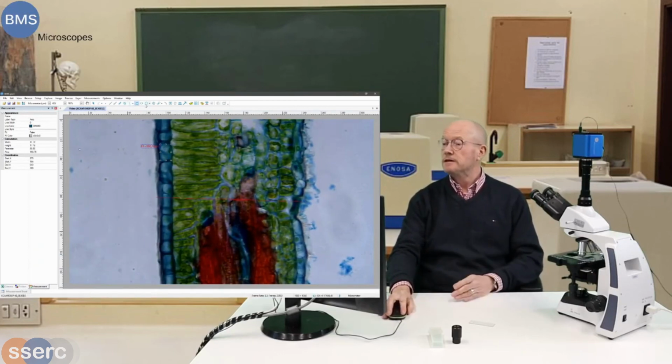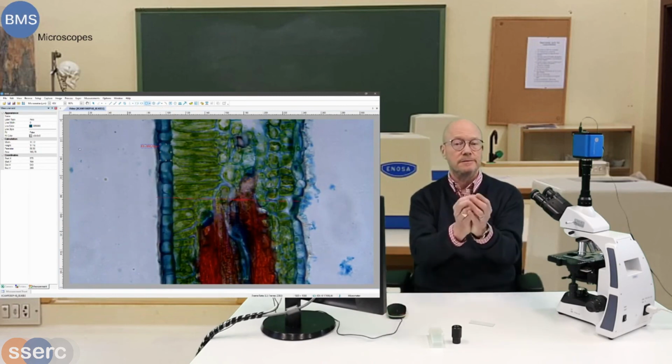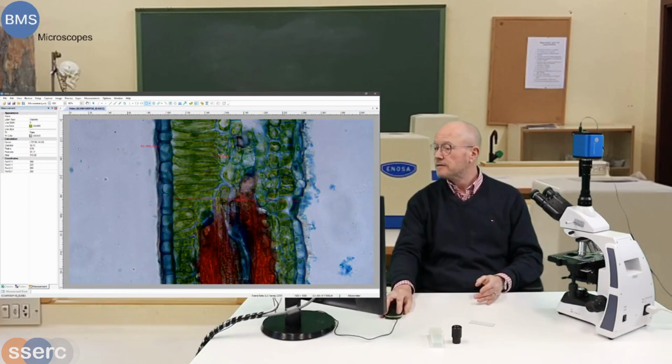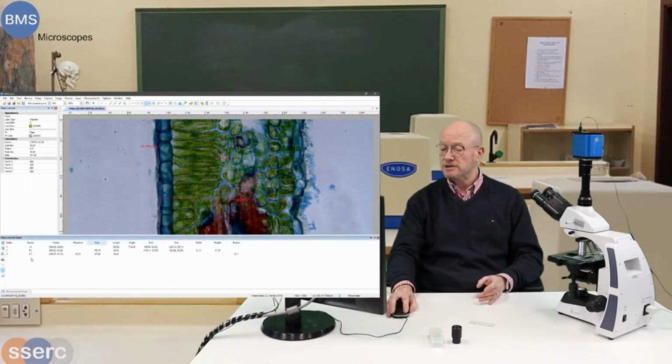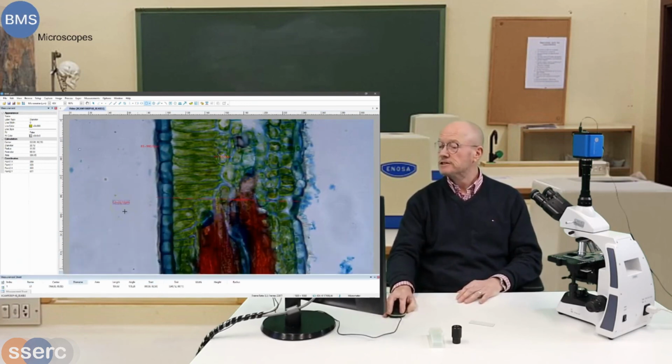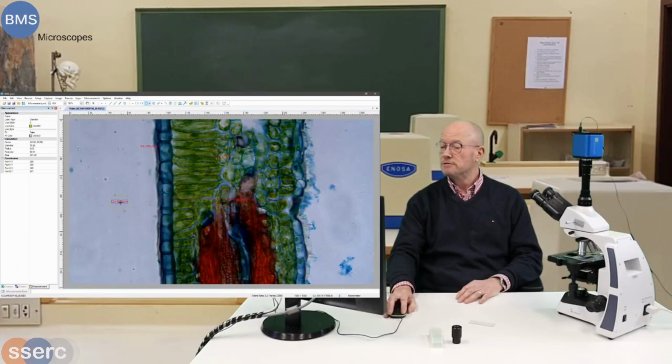I can do a circle measurement also if I want. Here is the circle measurement of 2 points. If you have, for instance, a core of a cell, you can measure that. For instance, we want to have this shape here. In circles, you can see here, when you see the measurement C1, it gives you the diameter, it gives you the area, and that is of course interesting to see also. If we do another length measurement, for instance, oh, wait, this is another circle, and I can lose this one. Yep, there it is, it's gone.